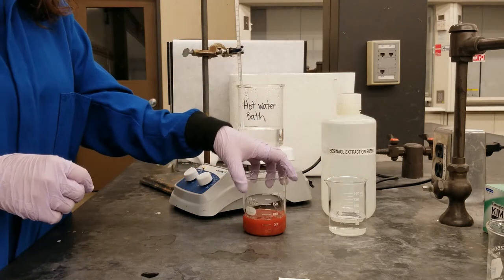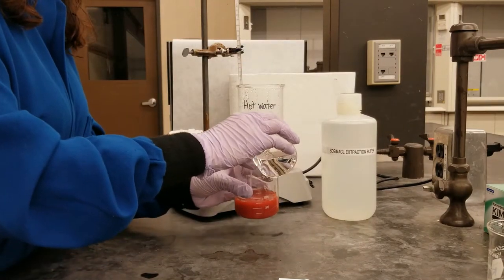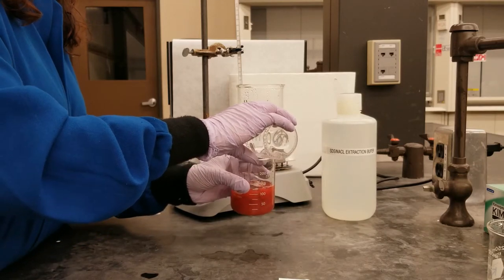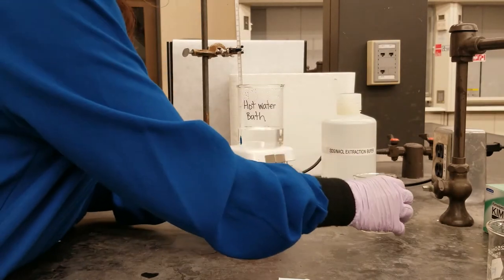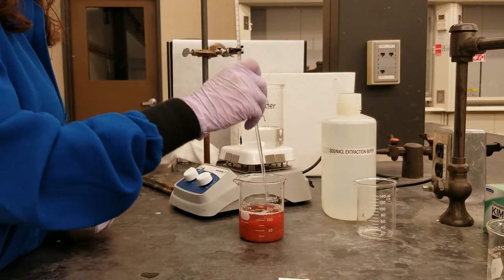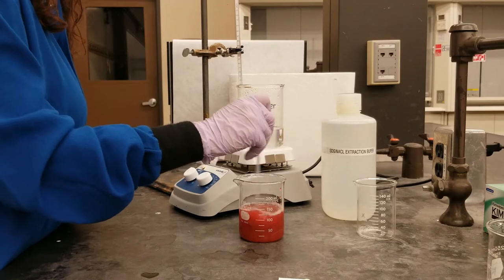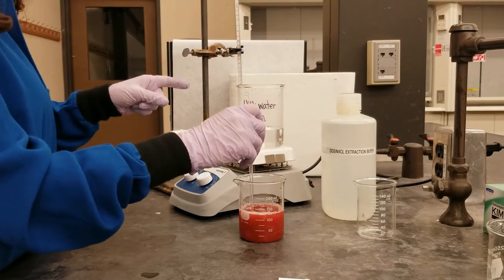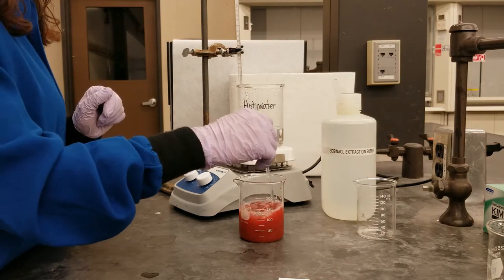Now to our slurry, we're going to add our extraction solution to extract the DNA from our strawberries. Once we have our DNA extraction buffer and our strawberry mixture together, we're going to mix it just a bit with our stirring rod and then place it in our hot bath that is at around 60 degrees Celsius.